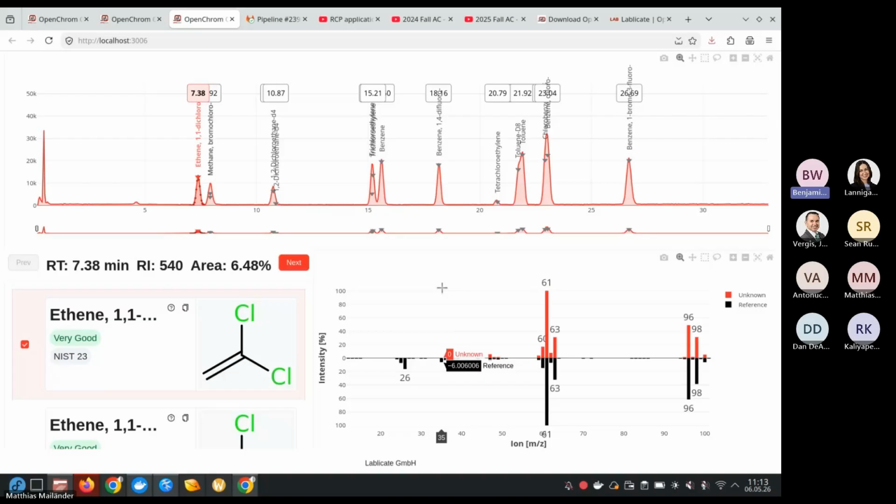So, this is something you could use. You don't have to look at the Allotrope stuff. It just hides it in a nice interface, I guess. So that's basically what we hear.